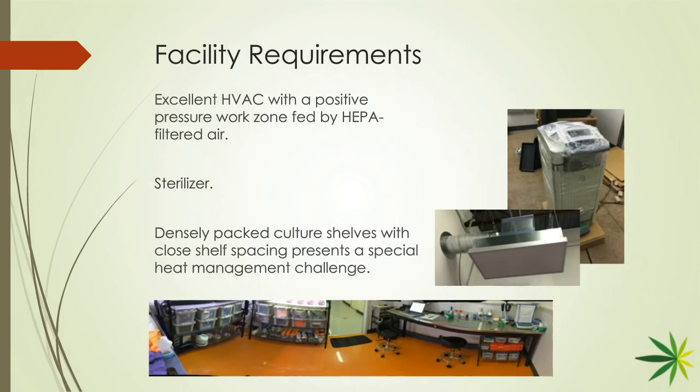So how do you build one of these things? What does it require? What goes into this? Does it require serious clean protocols with decontamination chambers to go in and out of, or can you get away with just alcohol and rubber gloves and a hairnet and maybe a little vent fan to help pull air out? How sophisticated does it have to be? I'm sure you can tell me the sky's the limit, or you can show me how simplified this little workspace is that you were very productive in. Absolutely, it's somewhere in between.